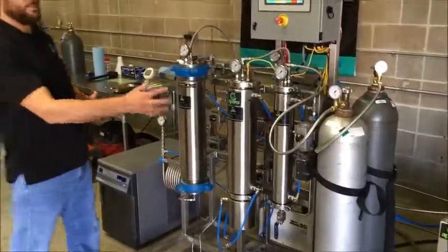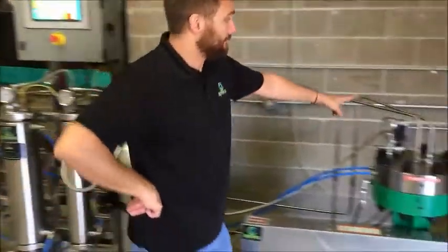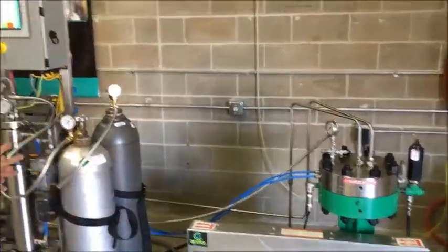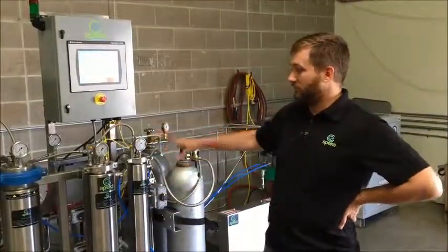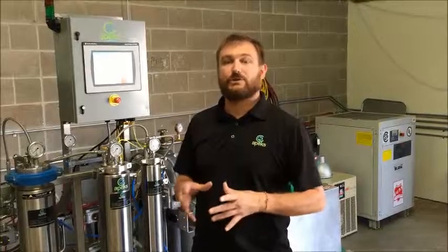When you buy a system and it arrives at your facility, you get three boxes — three crates. This main unit comes in one crate, the compressor comes in a crate, and the chiller comes in a crate. All you have to do to connect the three pieces is connect the water lines and a couple of gas lines.